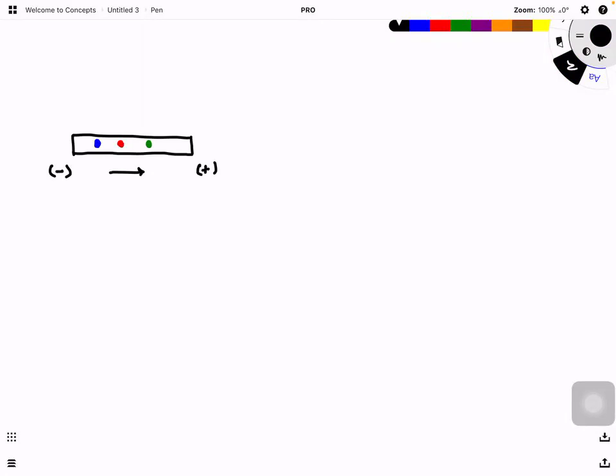So what we're going to do here is we place a membrane. And then we can place the blotting paper as usual. If we are rich, then we can have the blotter using an electric field to transfer. So when it transfers, some of this protein will bind to, will be trapped onto this PVDF membrane. Okay, this is a PVDF membrane. So in the exam, if you forget, just write membrane, that's enough.